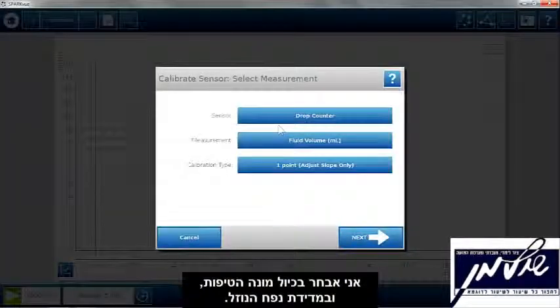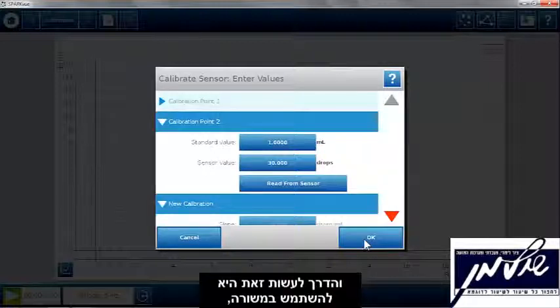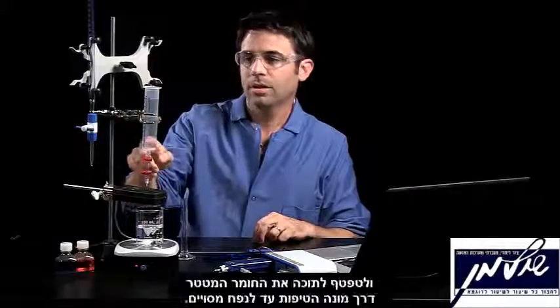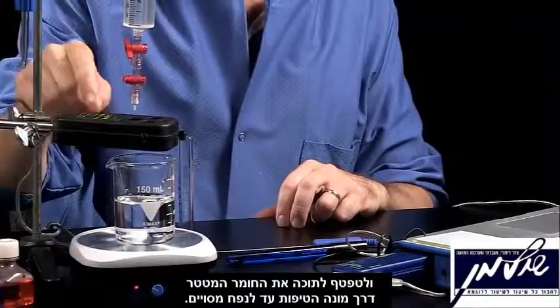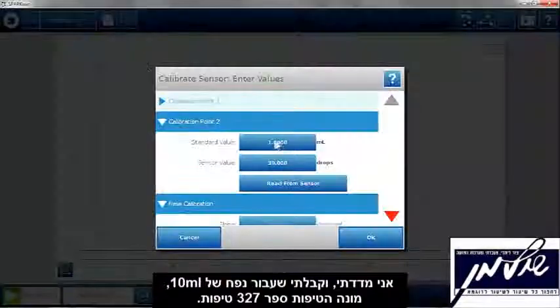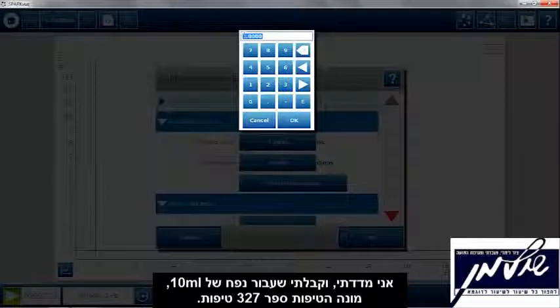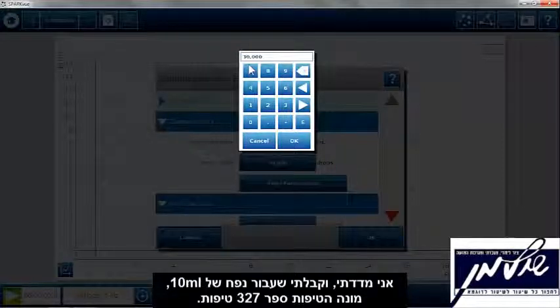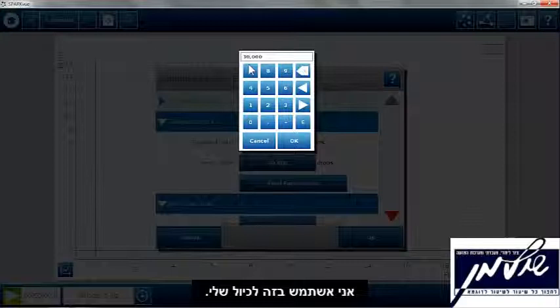I need to calibrate my drop counter so that it knows what the fluid volume is. The way to do this is you use a graduated cylinder — you drop the titrant through the drop counter into the graduated cylinder until a certain volume. I know that in 10 milliliters of volume, the drop counter counted 327 drops, so I'm going to use that as my calibration.